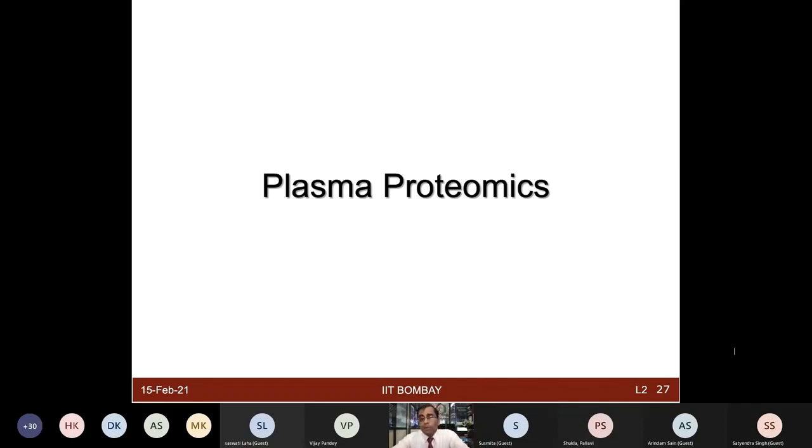And when you think about quantitative proteomics or targeted proteomics, these are all fancy things which everybody wants to jump into, but nothing is possible if you do not know how to prepare your sample to start with, because finally the technologies, like mass spectrometers, microarrays, and various other platforms, are very robust, but your input sample may not be of good quality.